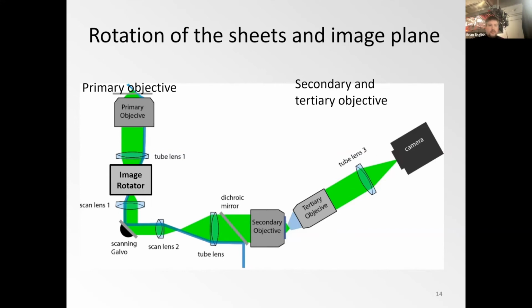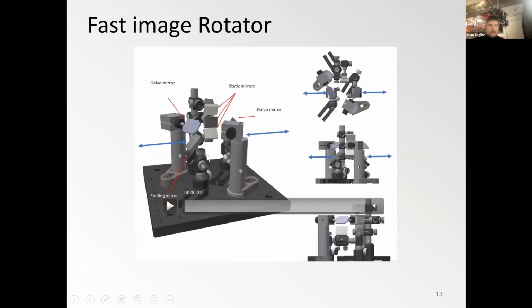I don't think that it changes though. Yes, you would have more space and more freedom to place it, but you essentially want to place it somewhat symmetrically around the image plane, so that the image is actually on the static mirrors, because else one of the galvos becomes more clipping.